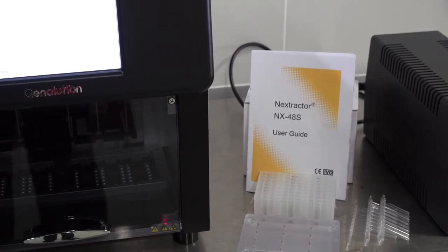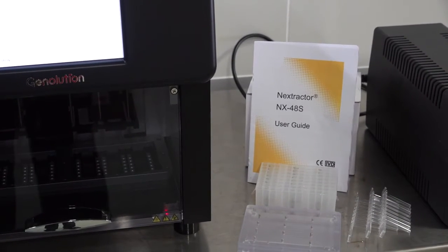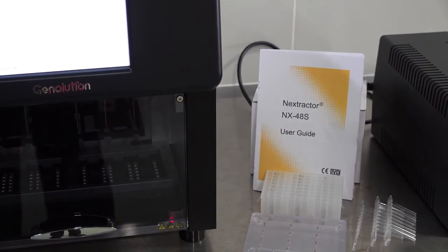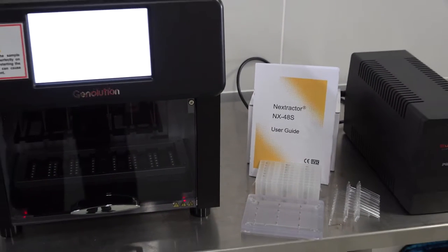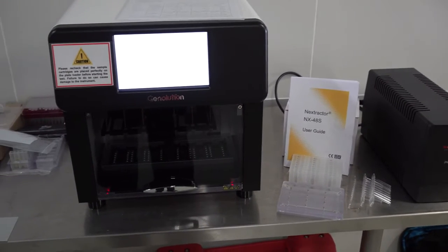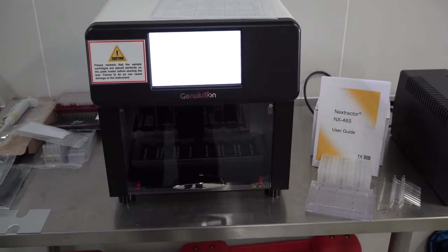RNA extraction of viral samples has become a routine procedure in most biosafety level 3 laboratories. However, this procedure is governed by specific procedures related to biosafety and biosecurity.